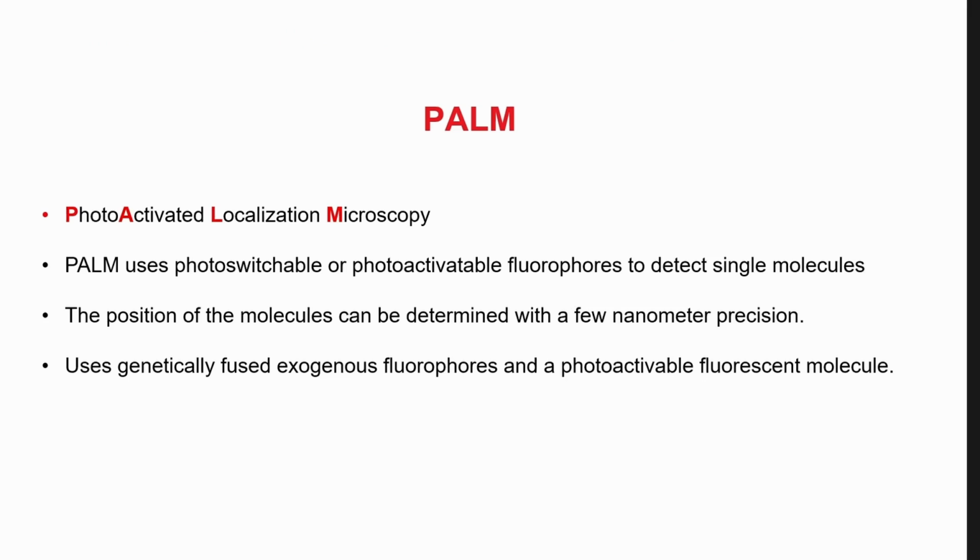In general, they are called single molecule localization microscopy, or SMLM, as a collective name. And the idea is exactly that we somehow, one way or the other, force molecules that after excitation with the fluorescent excitation laser, they do not emit photons, they do not go back to their ground energy state at the same time, but rather they come back slowly and gradually.